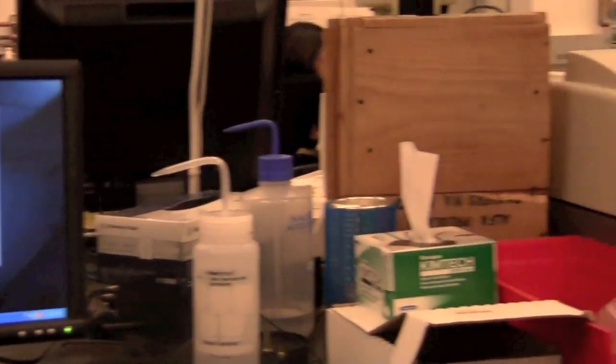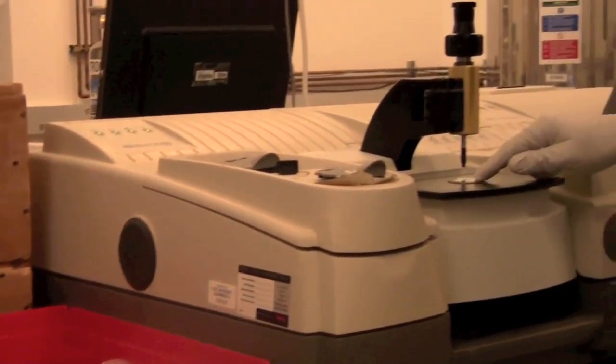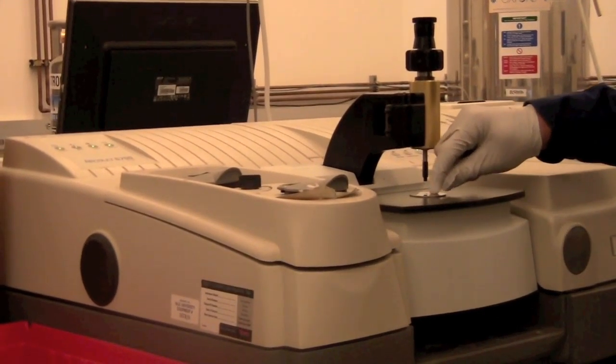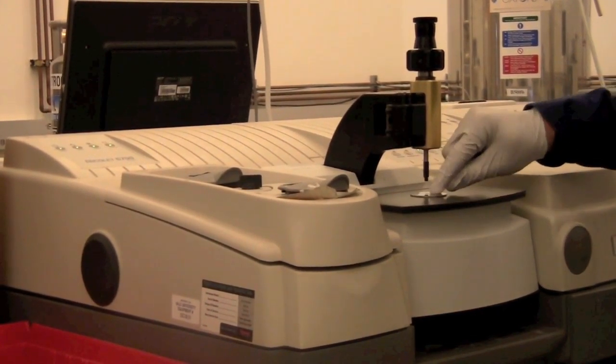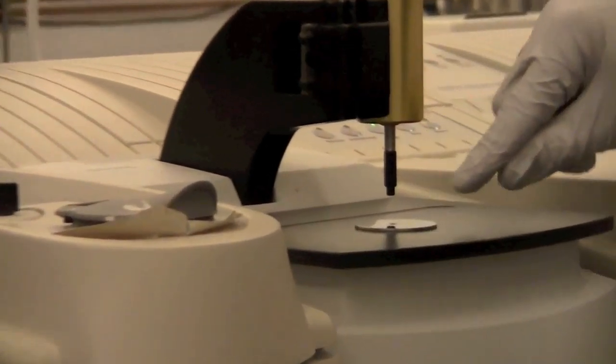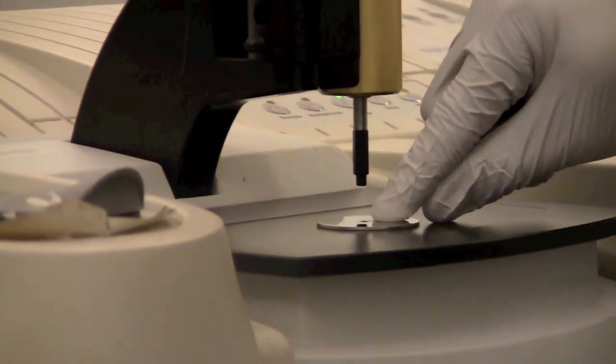You can put solid or liquid samples on the diamond here. The diamond is just the small circle in the center, not the whole area here. It just looks like a little clear window in the center of this sample tray here.